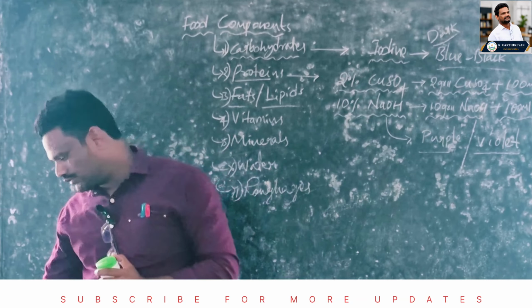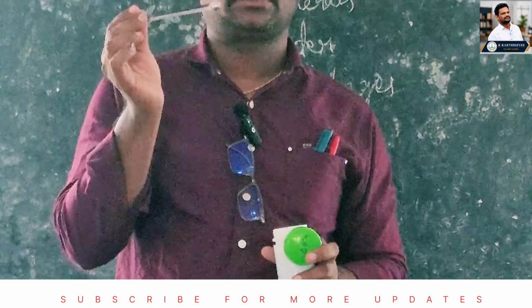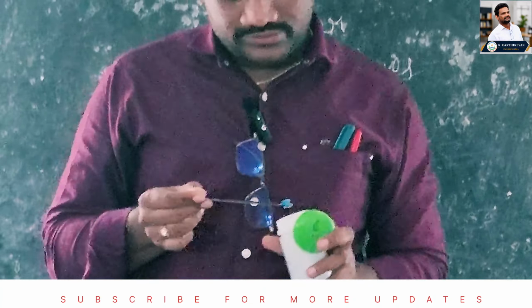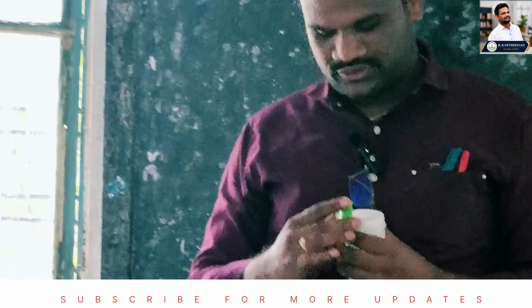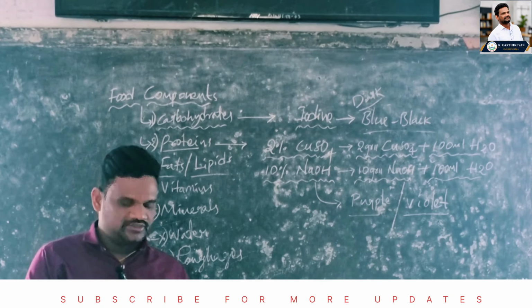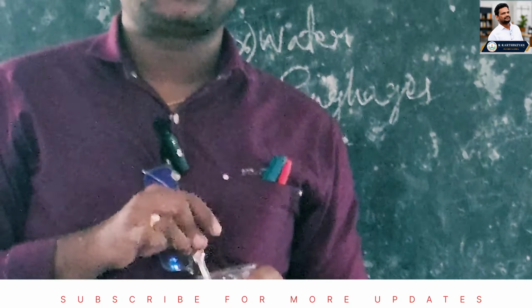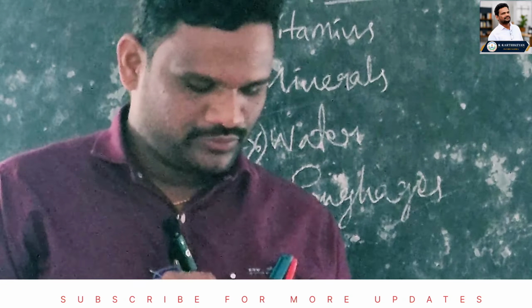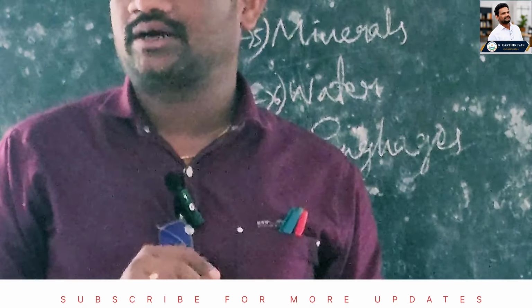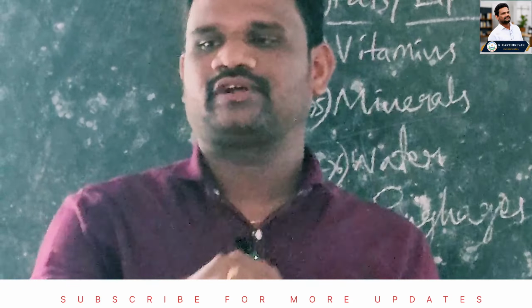Okay, now this is CuSO4. For CuSO4 we have to add 2%. Imagine the capacity of the spatula is 1%. Now we have to add how many grams in the 100 ml of water? 2 grams. Imagine 1 gram, 2 grams. Now stir it well to make 2% CuSO4. When these 2 grams of CuSO4 are mixed in the 100 ml of water, it will become 2% CuSO4. What is meant by CuSO4? Copper sulfate. Now we have made 2% copper sulfate.